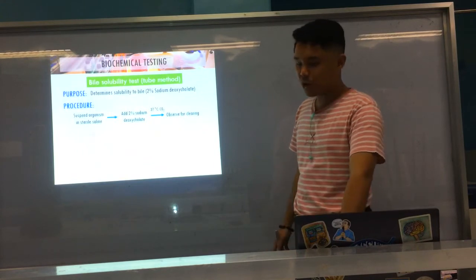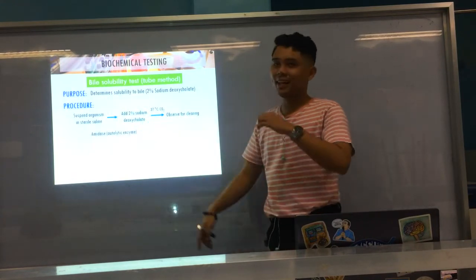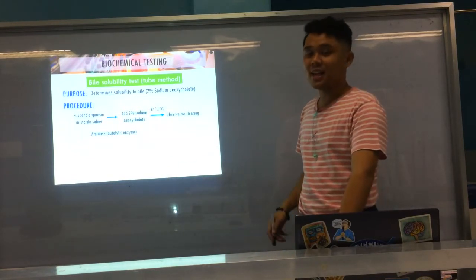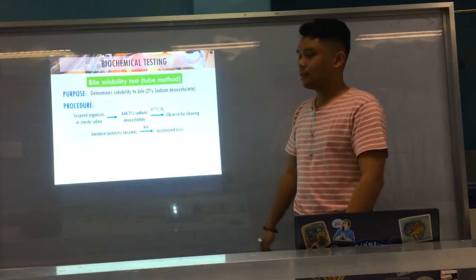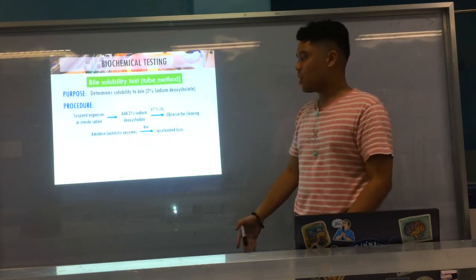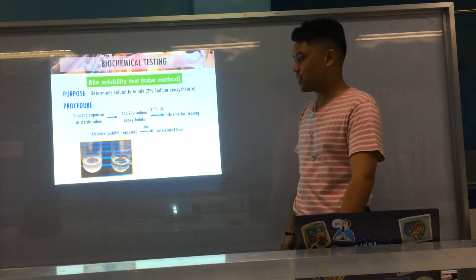What it does is, the bile salts promote or enhance the activity of the amidase or autolytic enzyme present in the organism. That's why the organism can lyse, its growth disappears, or the colonies lyse, therefore there is clearing in your solution. Okay? Alright. So, here's an example.